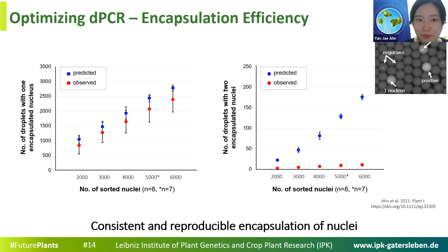The next question is, could you combine proteinase K and TECL? Did you use a different enzyme than TECL? Why did you use TECL? I tried to combine proteinase K and TECL to go even further. But if I can be honest, proteinase K was not working very well in my hands. It was giving inconsistent results, and it was a bit laborious because you need to digest with proteinase K first and then resort them into the PCR mix. So I didn't really like it, and it was not giving consistent results. That's why I didn't combine them.